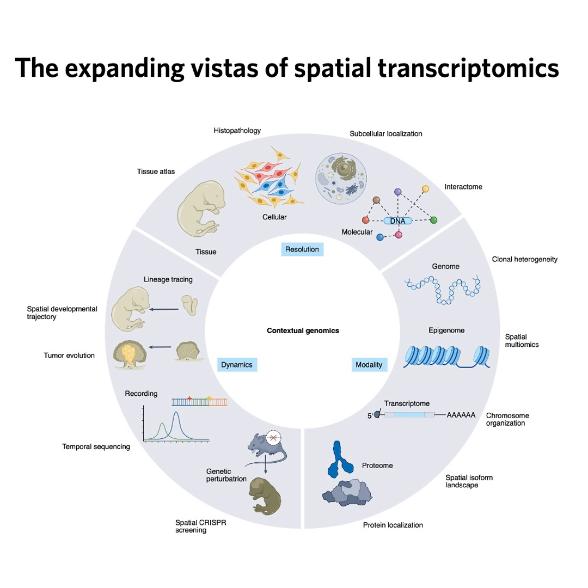What else? Second, they sometimes use enzymatically assisted methods. Here, they use molecular biology tricks, often involving enzymes like polymerases doing something called rolling circle amplification, RCA, right there in the tissue. This creates a much, much brighter amplicon, a big ball of DNA copied from the RNA target, which really boosts the signal-to-noise ratio, makes faint signals easier to see. Brighter signal means easier detection. Got it. And the third way?